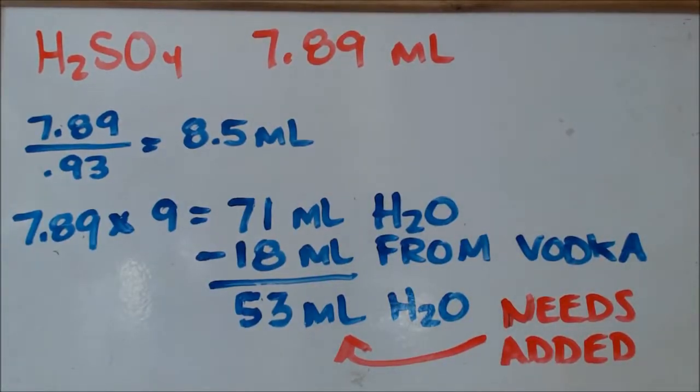Alright, now I want a dilute solution of acid. Usually that means 10% if they don't specify. 9 out of 10 times you'll be right. Of course, that 10th time you'll be wrong. But I'm going to put it at 10%.